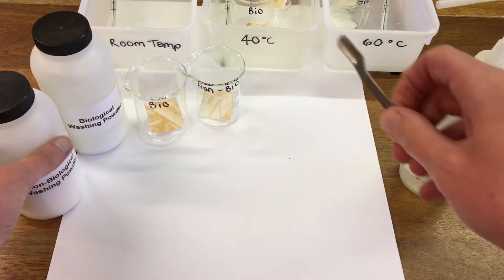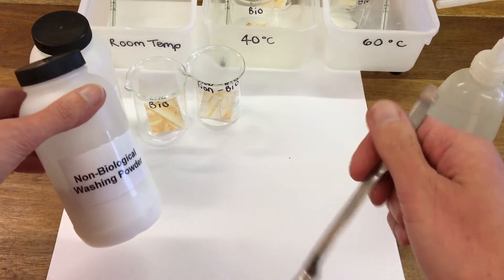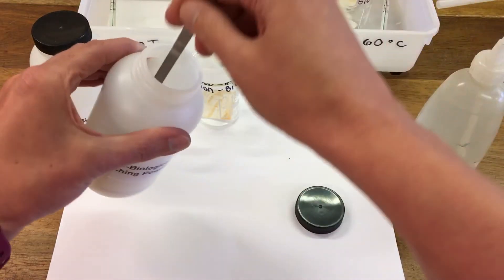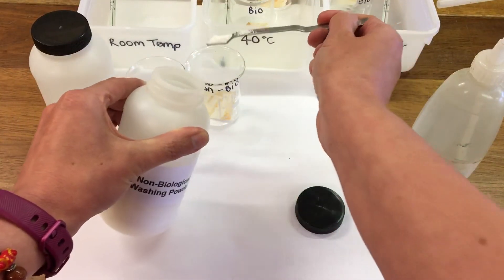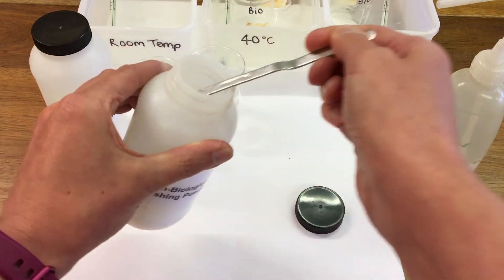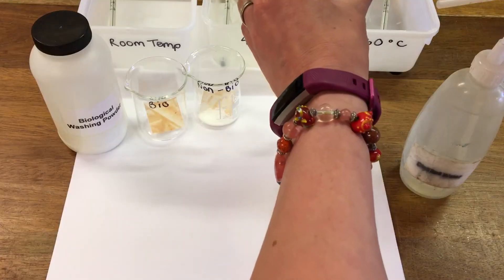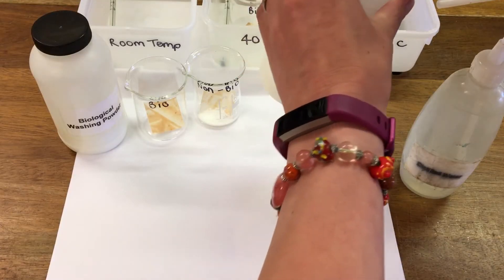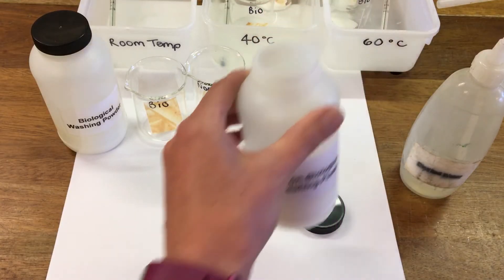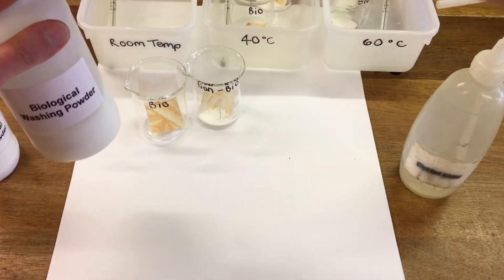I'm going to pop a spoonful of each of the washing powders into each beaker. First of all we've got some non-biological, and then I'm going to use the biological washing powder.